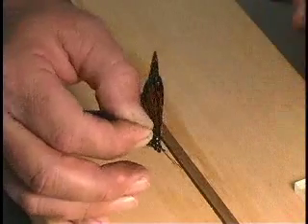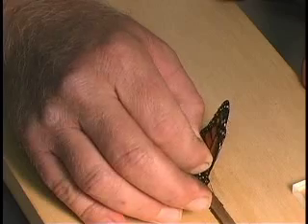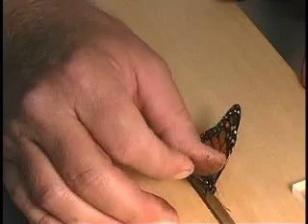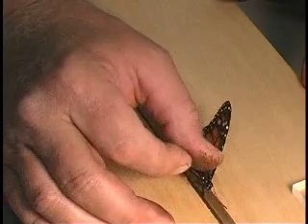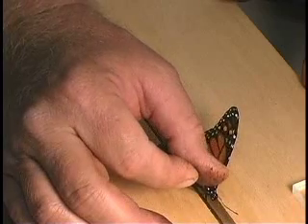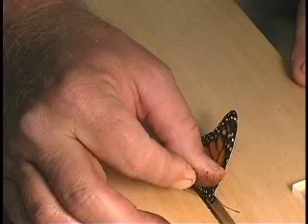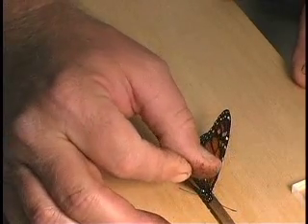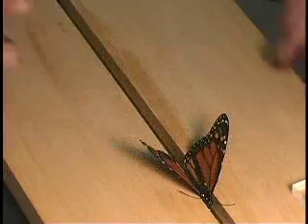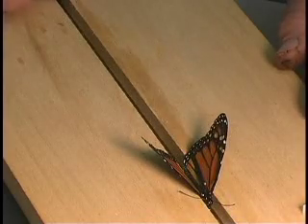Once that's accomplished, then place the pin into your spreading board at the foam bottom into the center, and you'll need to visually inspect the insect once again from the side and from the front or the back to make sure that the pin is going straight into the pinning bottom. That way the insect wings will be positioned properly when you get ready to move them forward.